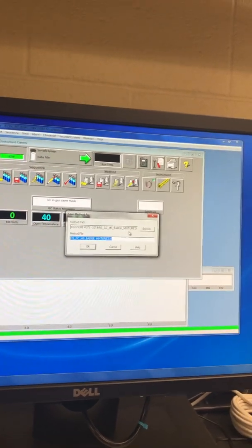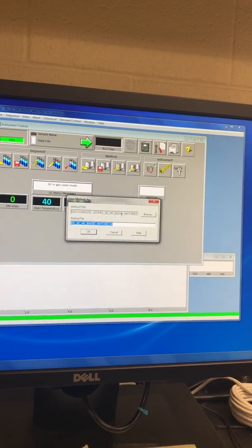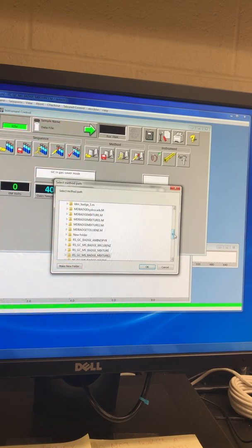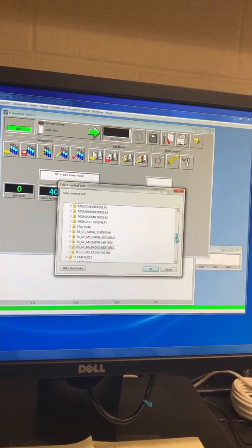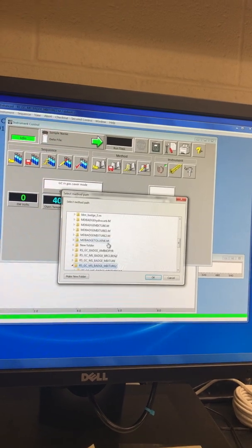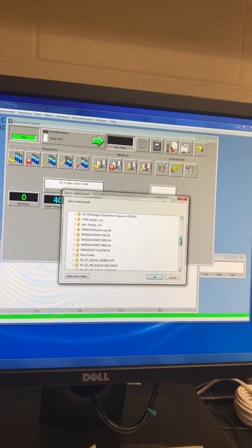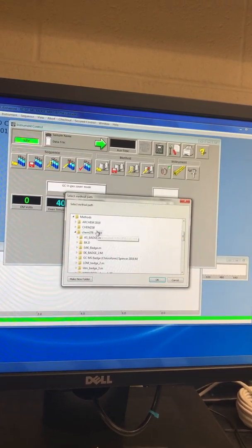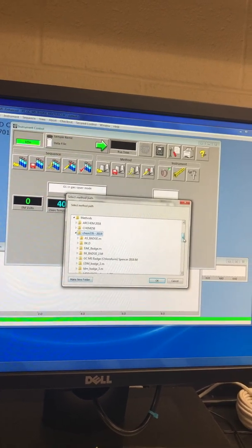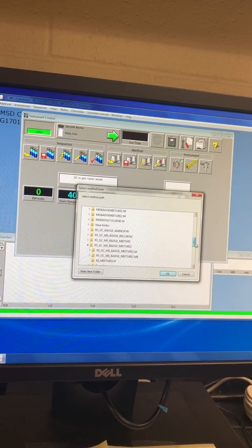So now you're going to find the method path. So this is where you want to store your method file. So you click browse. So right now I have a folder in here called mixture2 that I designated for this particular run, but you can also select Chem 376 and then make a new folder and then just title the folder to match the sample that you're running.